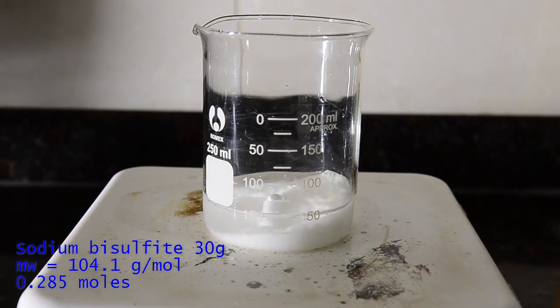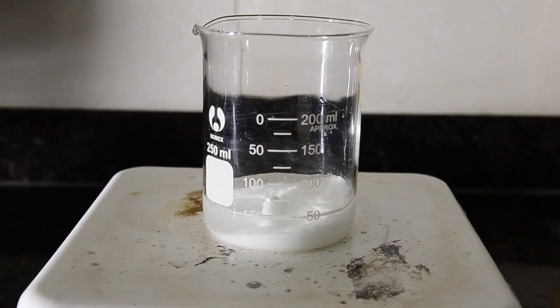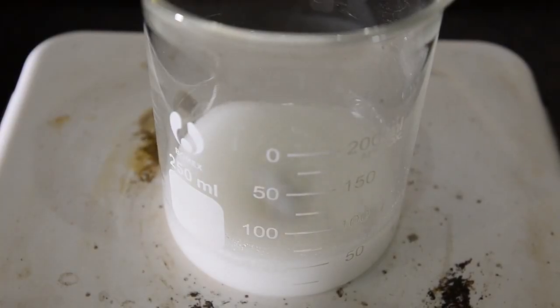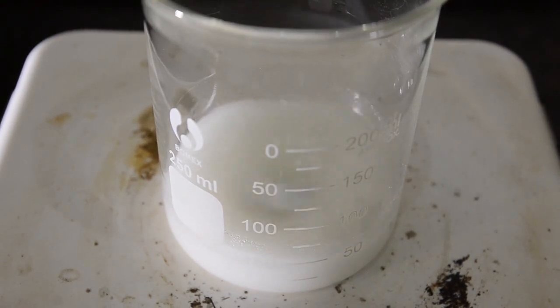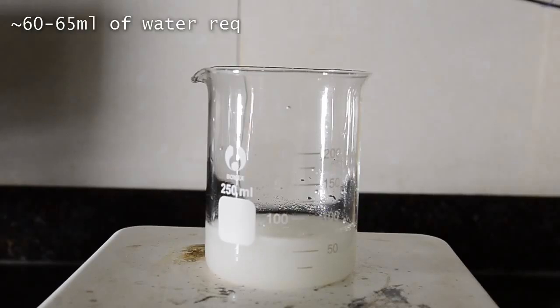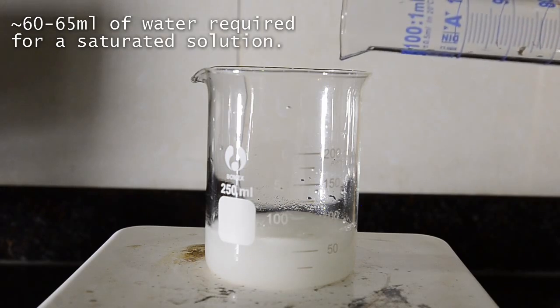Add a stir bar and then add 50 milliliters of water. We need to dissolve the bisulfite in order to make a saturated solution. Stir well and add water as needed to dissolve, but go slowly as the dissolution will take some time.